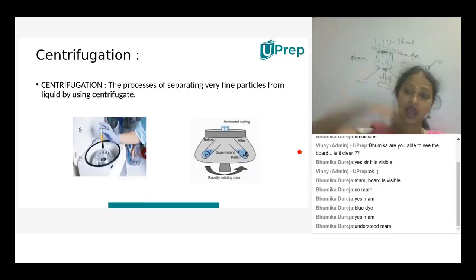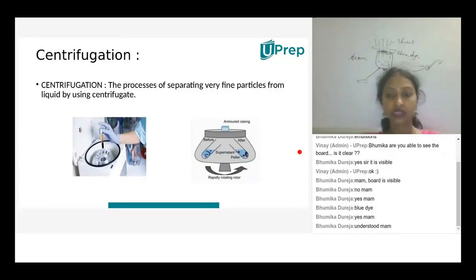With the help of the hand, like how we spin yarn, have you seen it? In the same way, when we rotate it, the tubes rotate manually. Both will be present in any laboratory. One uses electricity and the other is manual.